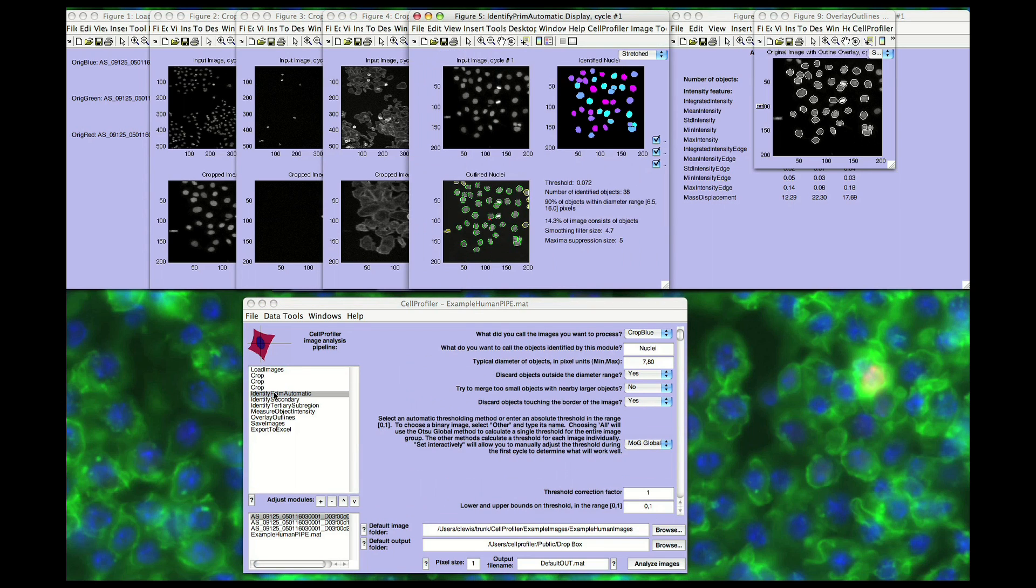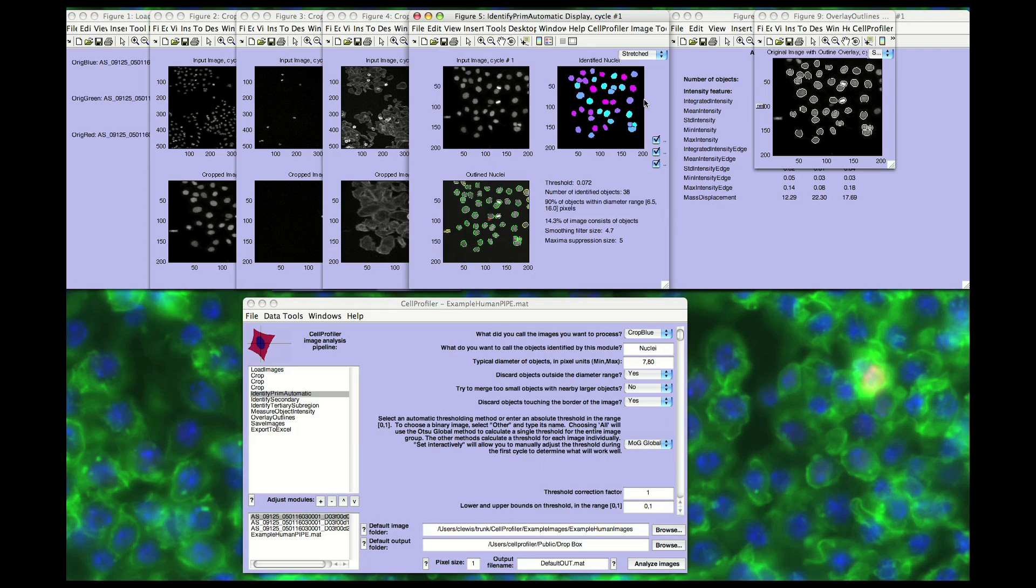The Identify Primary module identifies the first objects in the image, such as nuclei from DNA-stained images. Most importantly, to effectively identify objects, Cell Profiler is able to separate clumped objects, creating separating lines between the objects, and then removing objects based on measurement criteria, such as their size or shape.